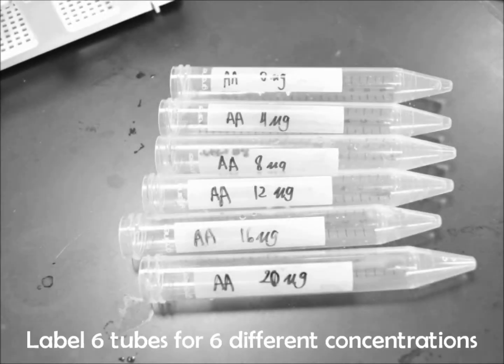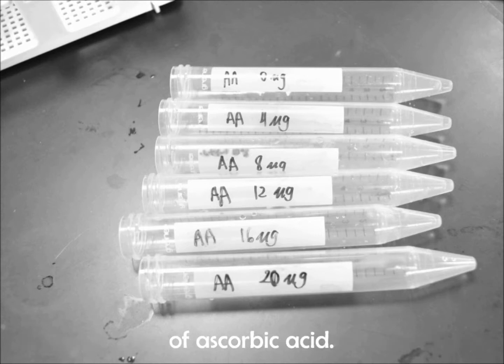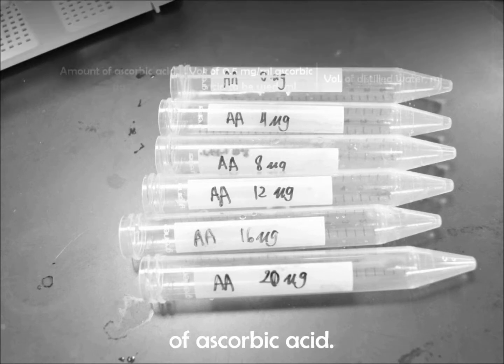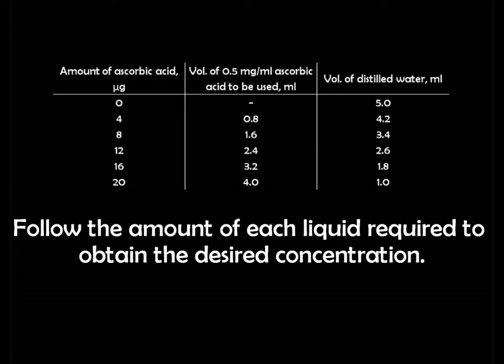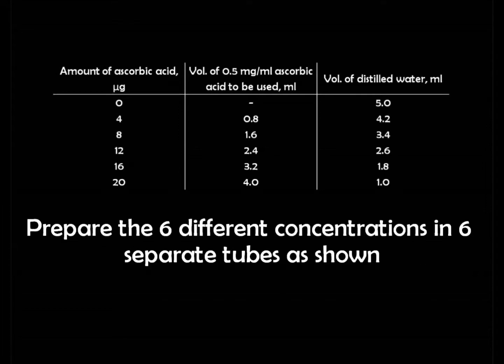The second part of the experiment is meant to prepare a standard calibration curve. Label 6 tubes for 6 different concentrations of ascorbic acid. The following table may be found in the lab manual. Follow the amount of each liquid required to obtain the desired concentration. Prepare the 6 different concentrations in 6 separate tubes as shown.